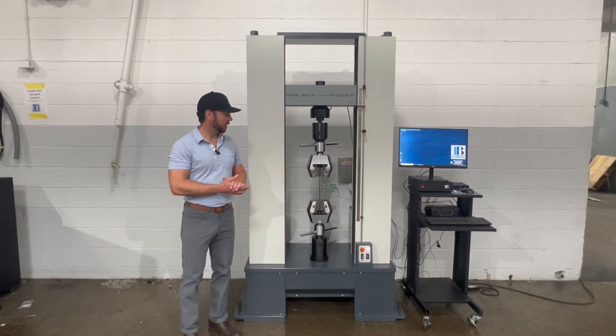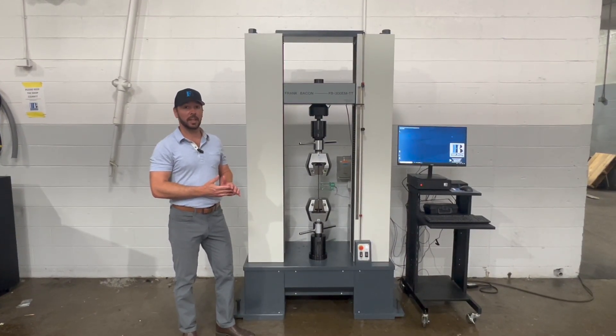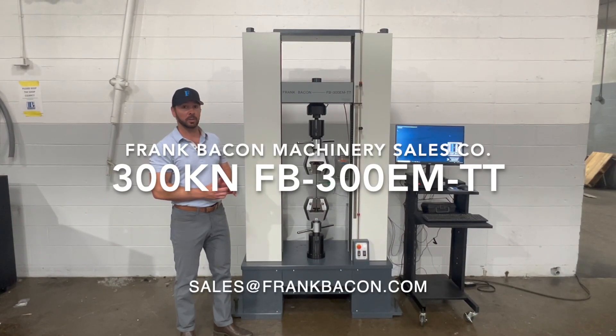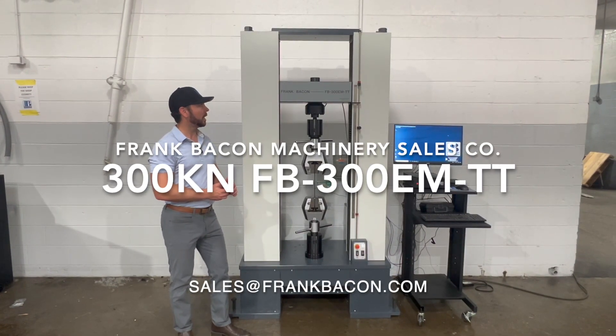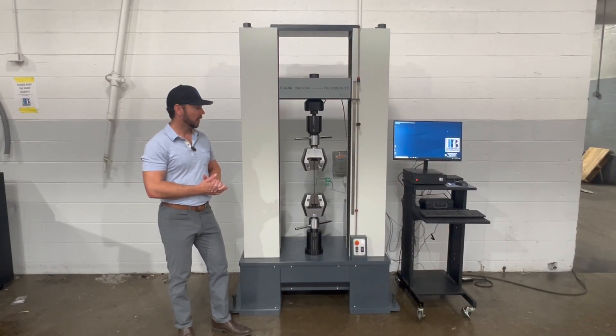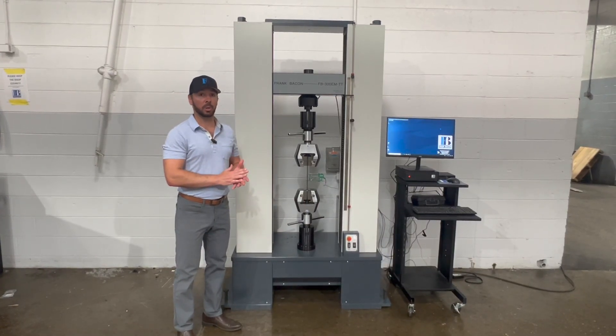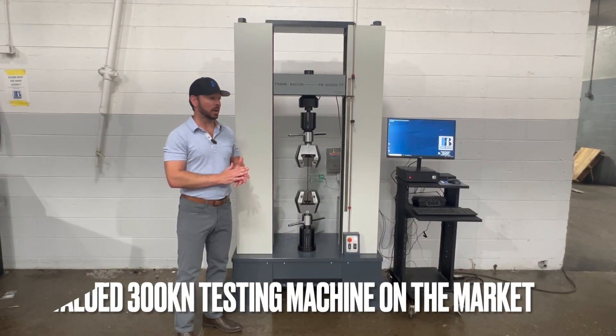Welcome to Frank Bacon Machinery. I'm here today to show you our new FB 300 EMTT, which is a 300 kilonewton, 67,500 pound force universal testing machine. We built this machine from the ground up to be the best valued 300 kilonewton machine on the market.